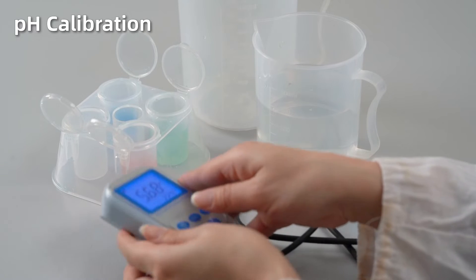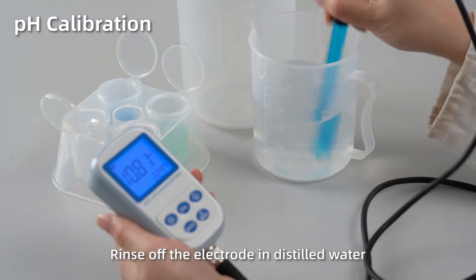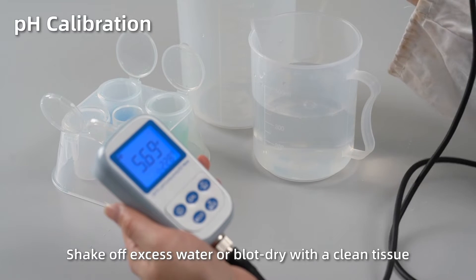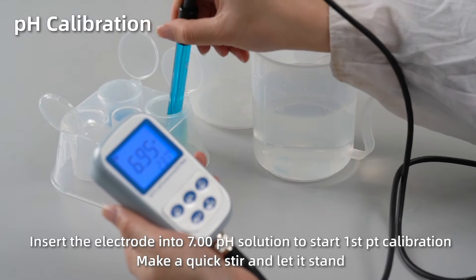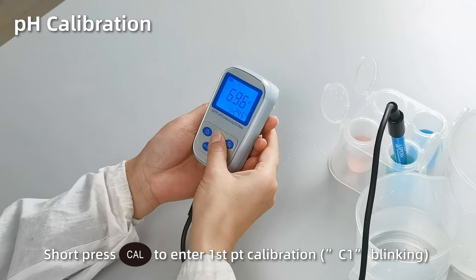pH calibration. Rinse off the electrode in distilled water. Shake off excess water or blot dry with a clean tissue. Insert the electrode into pH 7 solution. Make a quick stir and let it stand. Short press cal to enter first point calibration.